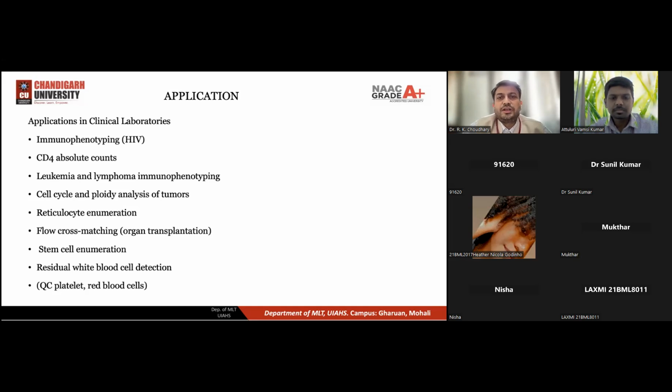Now, what are the applications? This is important. Of course, immunophenotyping. We are here writing for HIV. We usually use it for that, but it's not only HIV. We can do all immunophenotyping. What is immunophenotyping? Anybody knows? Phenotyping.